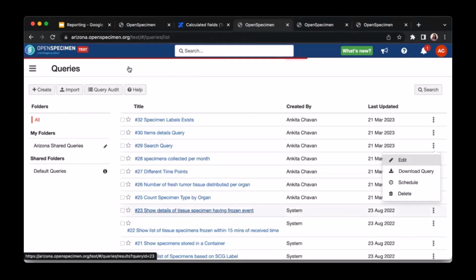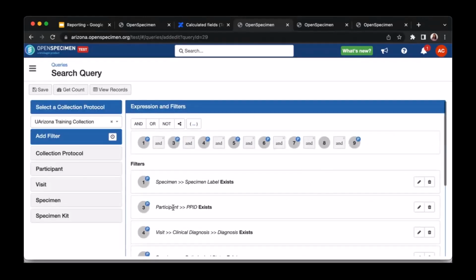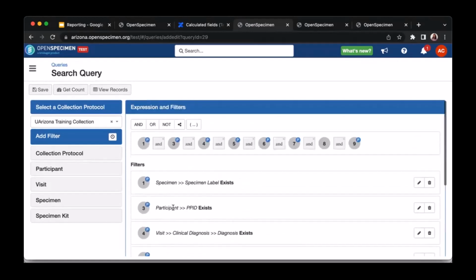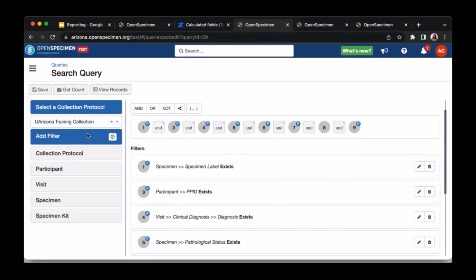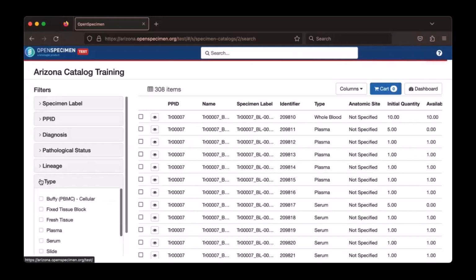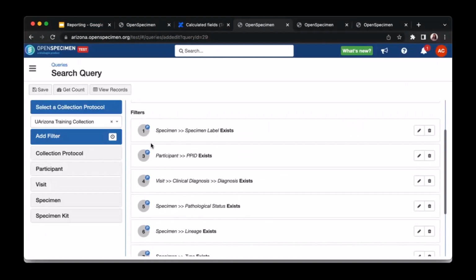So all the fields which you want, you will filter it out and take out the data from it. Just one thing which is necessary here is to parameterize the filters. So if you see, the filters I am seeing here all are parameterized. So I can select what I want from the filter here. So that's why you will parameterize your filter.